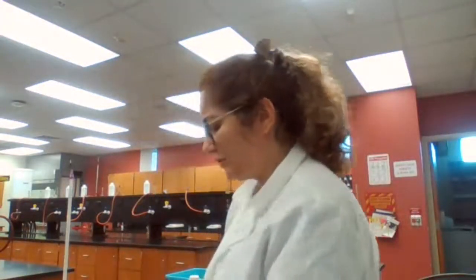The other application is for identity of the compound. If we have an unknown and our unknown melts at, let's say, 123, and then I look at the two or three known samples that we have, and my benzoic acid sample melts at 122, and naphthalene melts at 80 degrees, then what is my unknown? Which one of these two compounds matches the unknown? So if they tell me that your unknown is either naphthalene or benzoic acid, I measure the melting point for the unknown. If it's close to the melting point for naphthalene, then it's naphthalene. If it's close to the melting point of benzoic acid, it's going to be benzoic acid.